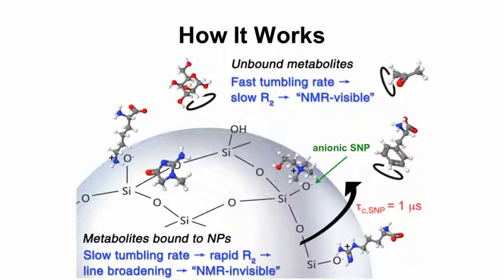You can play around, as I say, with other types of nanoparticles, ones that are positively charged, ones that have gold surfaces, ones that may have other kinds of reagents attached to them, which may have some affinity for certain metabolites. And again, this allows you to selectively remove certain metabolites just by progressively adding different types of nanoparticles. And it really doesn't perturb the system.